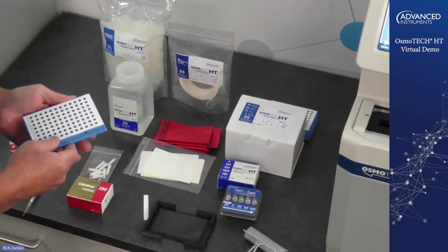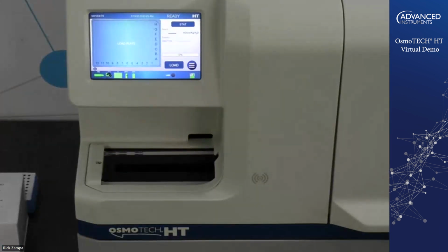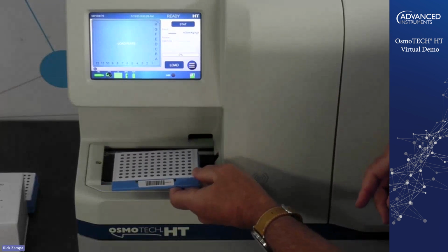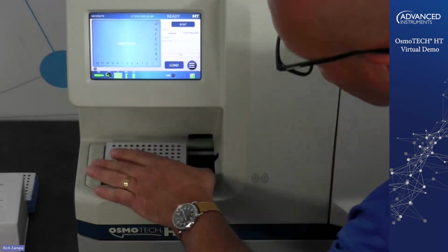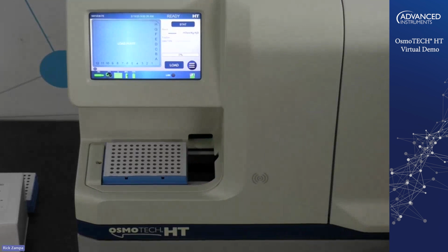I should have brought my remote control. I'm going to go back to position 2 here. So now what we want to do is load the plate onto the instrument. Now you see the barcode that I mentioned before. You want to take the barcode and make sure it's facing in, because there's a barcode reader right back here, which will read the plate every time we put it in there, and it will know which positions have been used and which positions haven't, so that we can continue to reuse the plate.